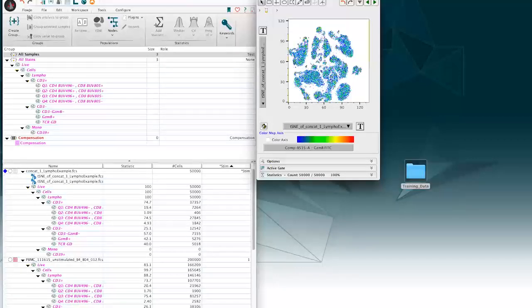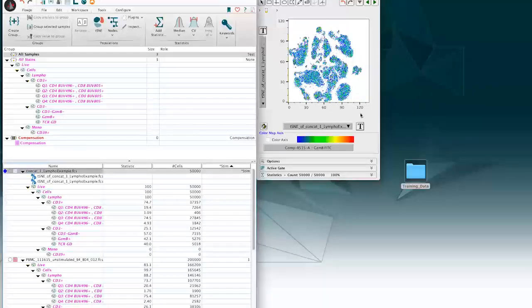So R is contributed to by the authors of these algorithms, and these tools are available as packages. I think the real barrier there is really getting familiar with the coding language and being able to operate within it. If you can do that, then all we're doing when we run this is exporting this file, delivering it to R, and then returning back results, right? And in this case, t-SNE is just running natively, and we've optimized it to run way faster than the R implementation. So t-SNE is better here.